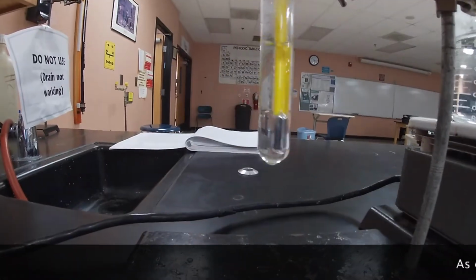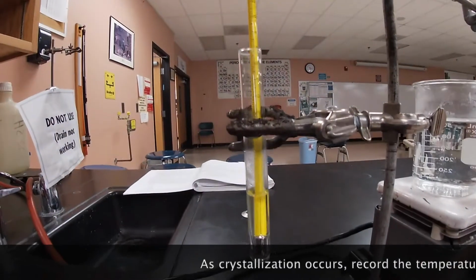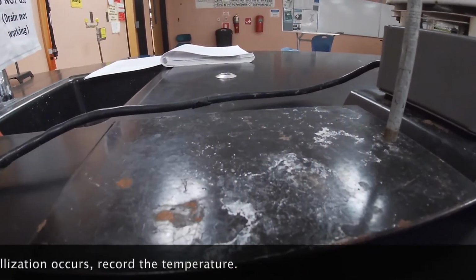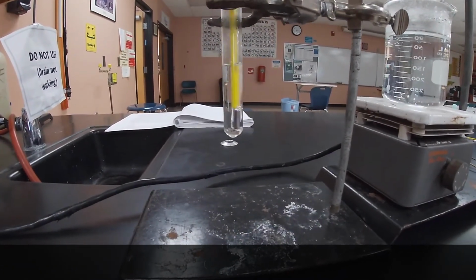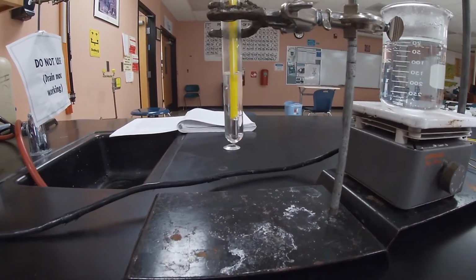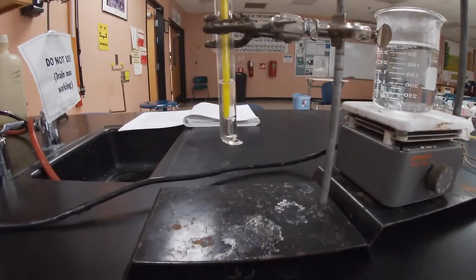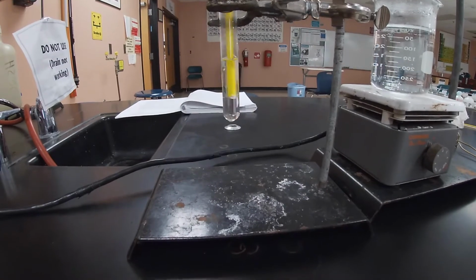You got to be careful on this one. The concentration is greater, so it tends to crystallize a little bit faster. So we're at about 63 degrees there. We're at about 63 degrees.